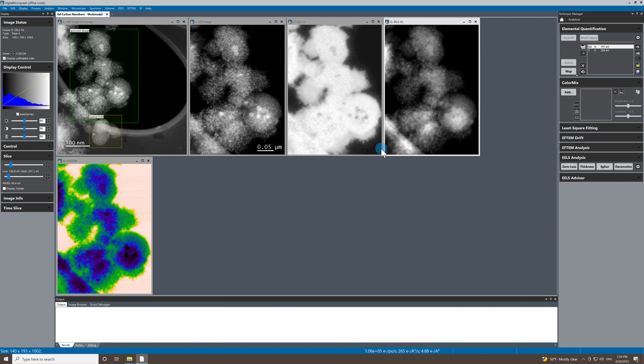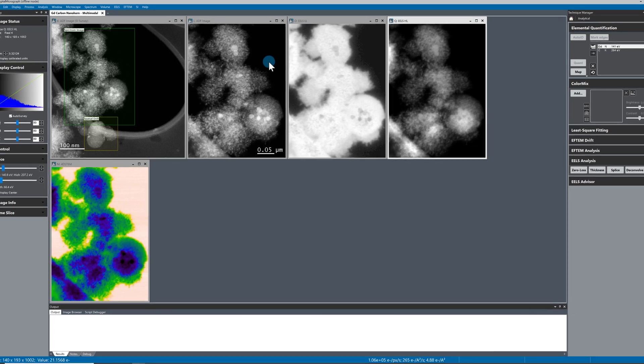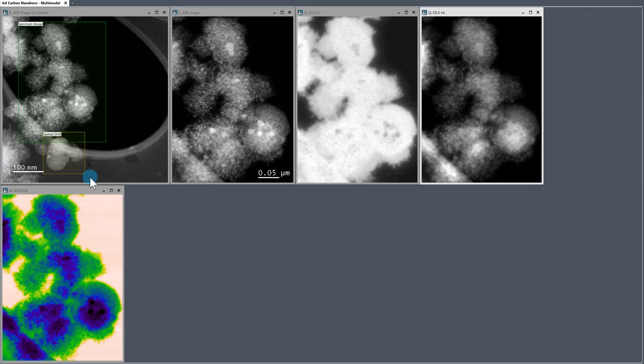So this is the region of interest that I targeted for the experiment. What's nice about this experiment is it's multimodal, so we have a dual EELS dataset - EELS low-loss, EELS high-loss, and 4D-STEM, so we have a diffraction spectrum imaging dataset alongside the two EELS datasets.